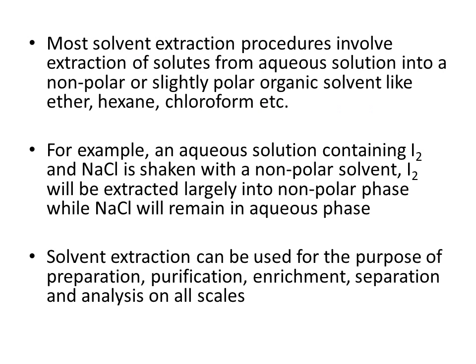Most of the time, solvent extraction procedures involve extraction of solutes from aqueous solution into a non-polar or slightly polar organic solvent. As I mentioned earlier, most of the time we are interested in separating a compound which is dissolved in water.